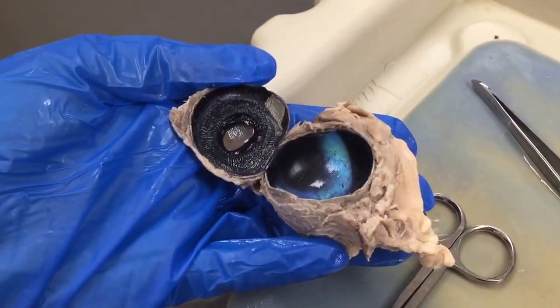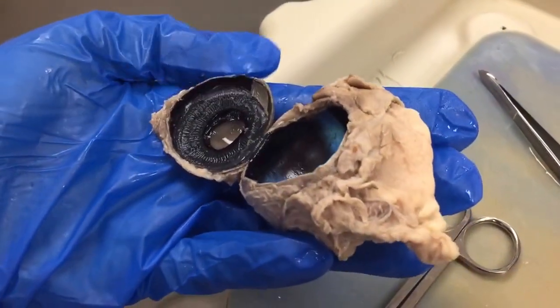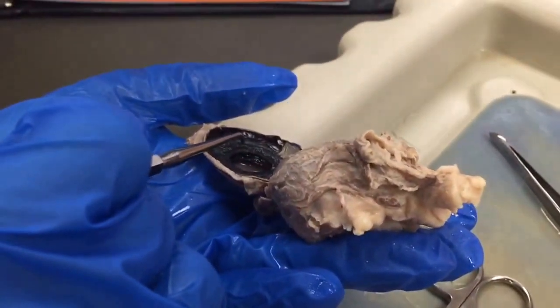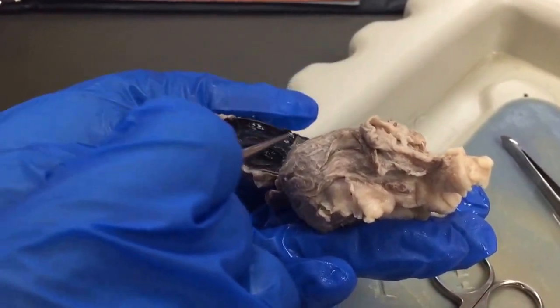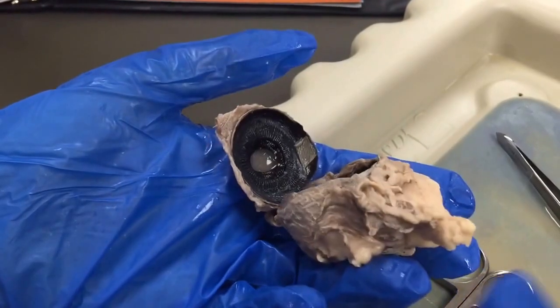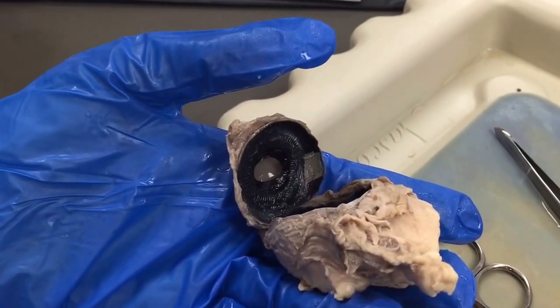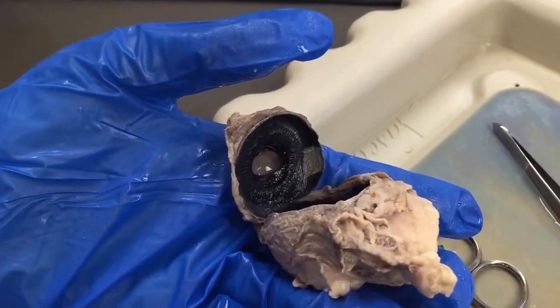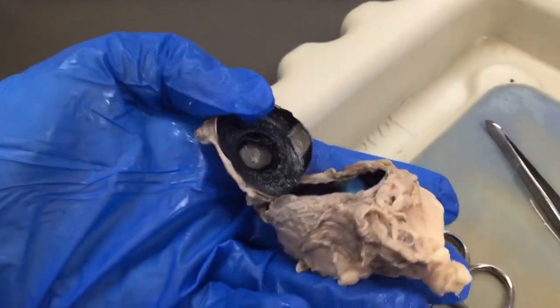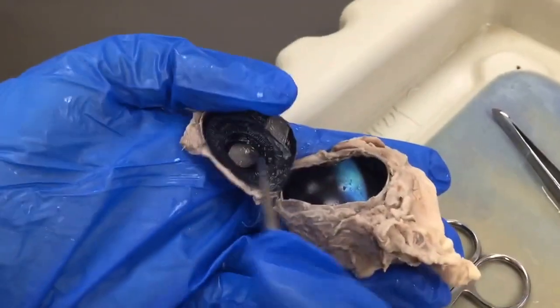I don't remember what the ora serrata is. Is that just like the outside? That's outside of the ciliary body. So you can see the ciliary bodies extend here, and then this part here that's all smooth is the ora serrata. The ora serrata marks the anterior margin of the neural portion of the retina. So it doesn't really describe a function. Those are the different parts of the internal structure.